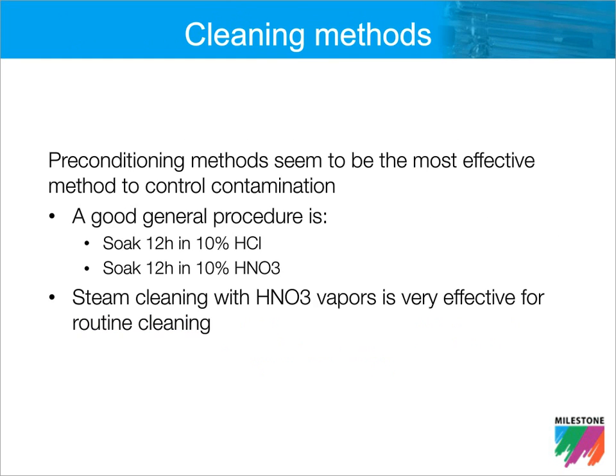Now, of course, cleaning any material that comes in contact with your sample during the process is a critical step. A good general procedure that many labs use is soaking these materials in either dilute nitric or dilute HCl for a period of up to 12 hours. And for the ultimate cleaning, really that acid should be hot, especially if we are using polymer type materials, because we want to basically swell those polymers and leach out any contamination that was bound within. Now, although effective, these general procedures or the traditional way of cleaning do have some challenges.